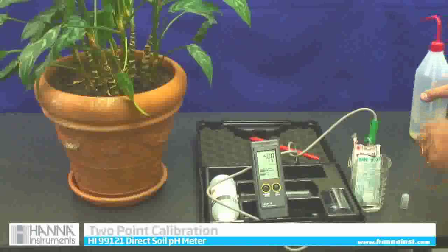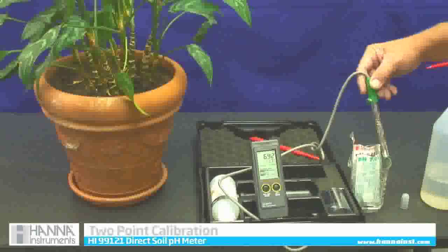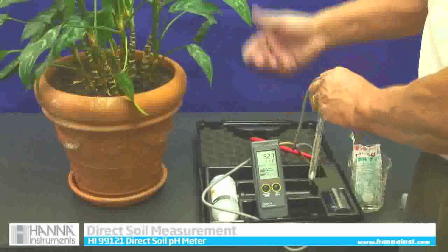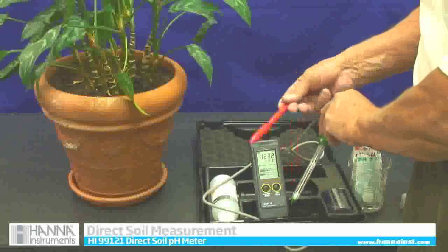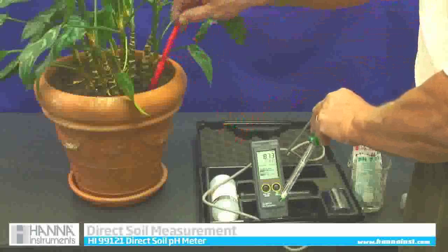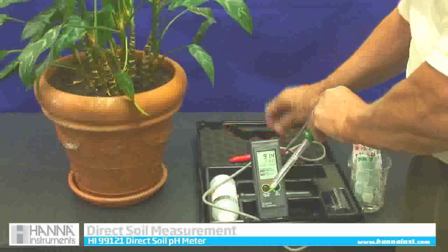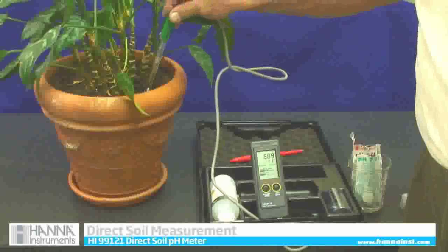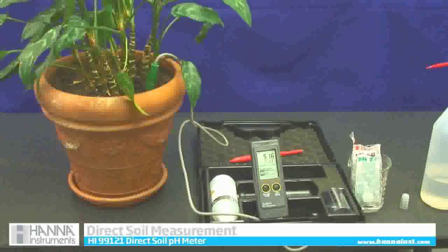I am going to rinse it off with a little bit of clean water. Now to take a pH reading in the soil, we have this lovely house plant that has been in the office. Because my probe is fragile, I am going to take the little dowel stick that comes in the kit, make a pre-drilled hole, and then just insert my meter into that hole. Whatever the green tip is touching will read. My reading is 5.18 — so it is close to 5.2 pH.